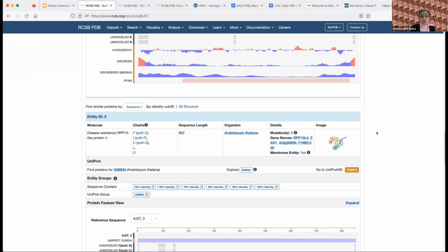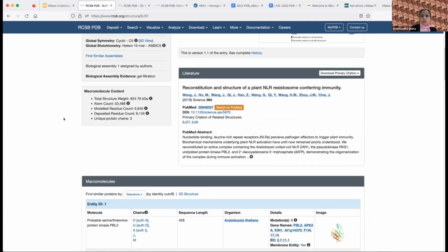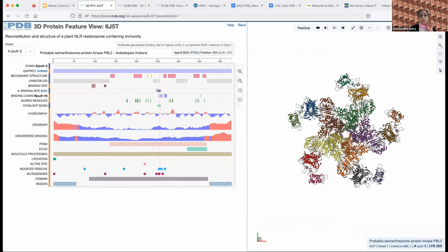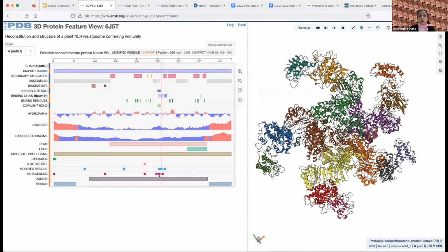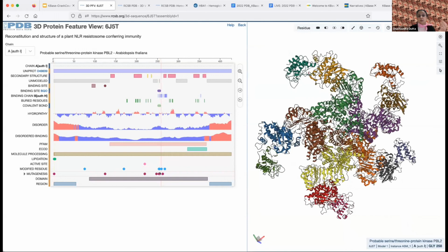And you can look at the 1D, 3D and look at the whole structure, but I actually wanted to open this quickly. So this is the structure that I showed on the slide, but I can quickly click on this to see where the interactions are with this particular ligand. This is where the ligand is bound. I can look at various mutagenesis points and notice where the ligand binds, there are mutagenesis points. So clearly mutations in those residues would interfere with the protein's function.